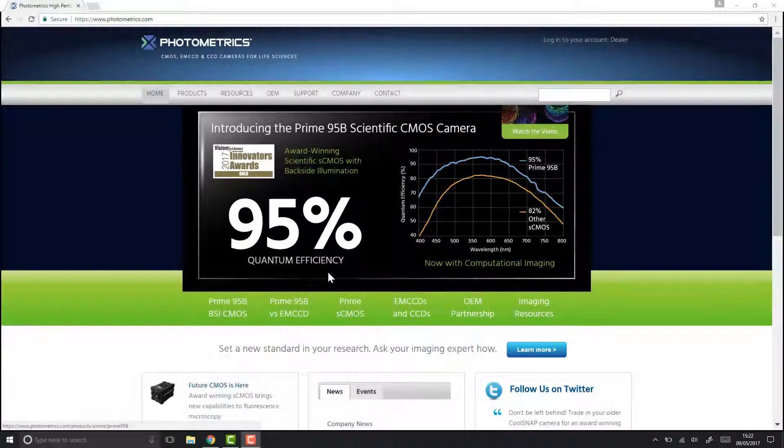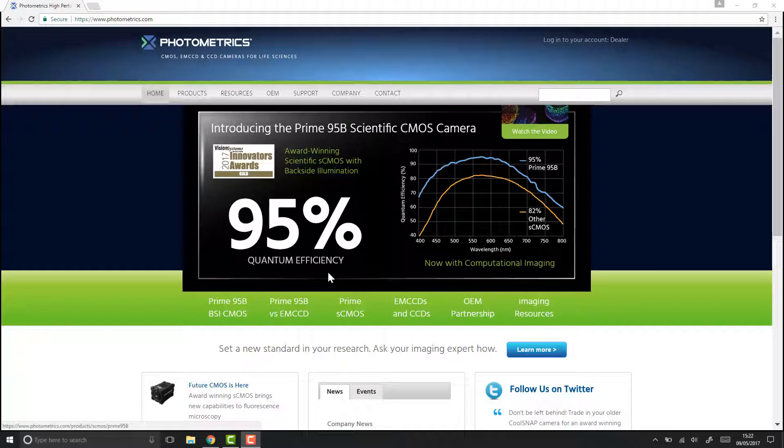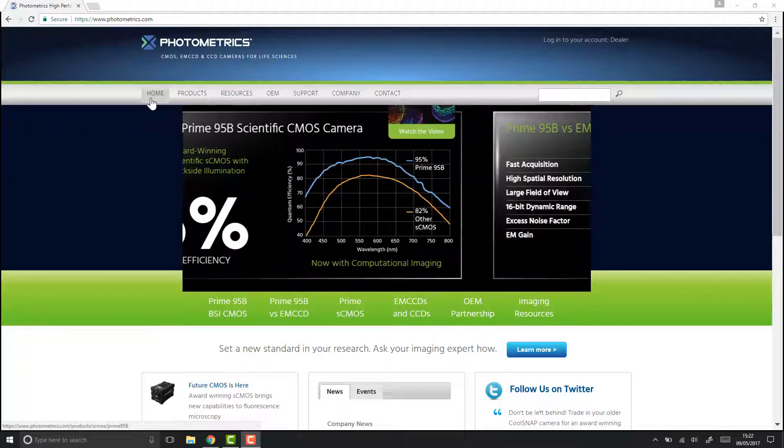In this video we're going to look at setting up a Photometrics camera inside Metamorph. The first step is to download and install the PV Cam drivers from the Photometrics website.